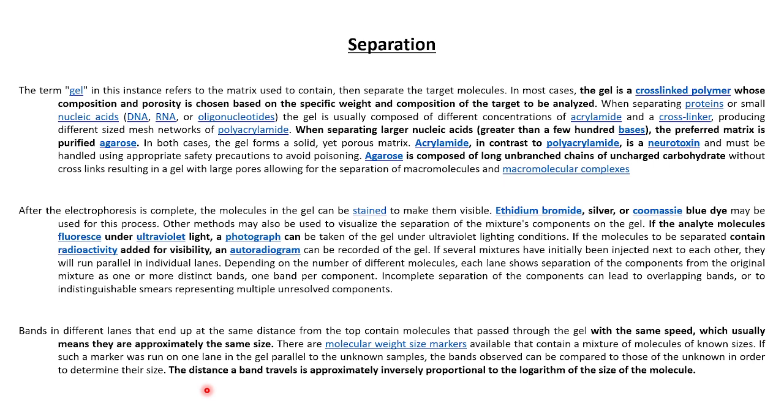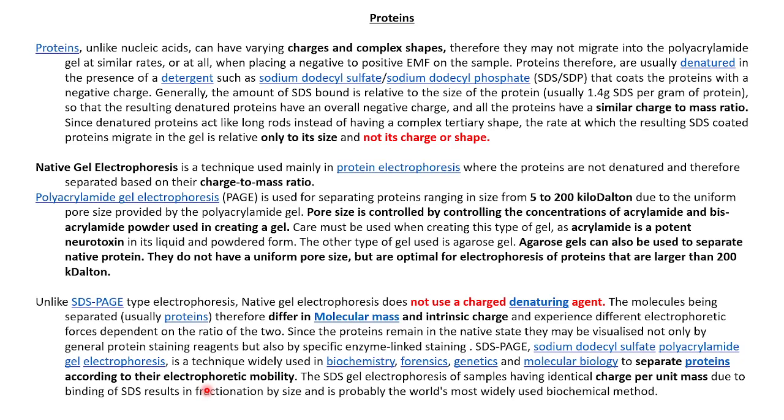This is even applicable for an agarose gel electrophoresis. So this is a very important graph that you can study. If you run some kind of SDS page in your lab, you can do these kinds of things even at home.